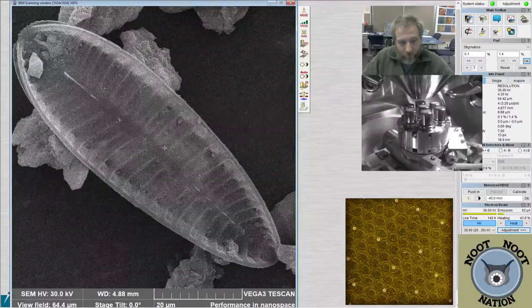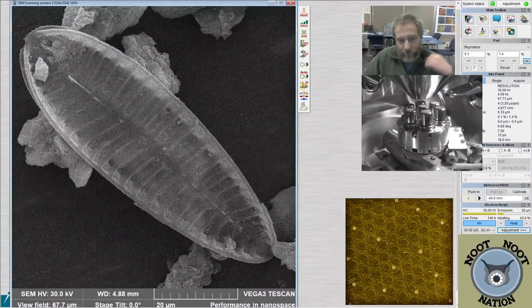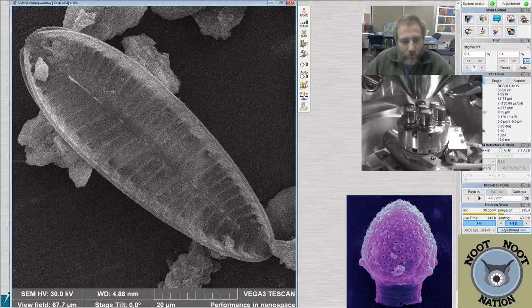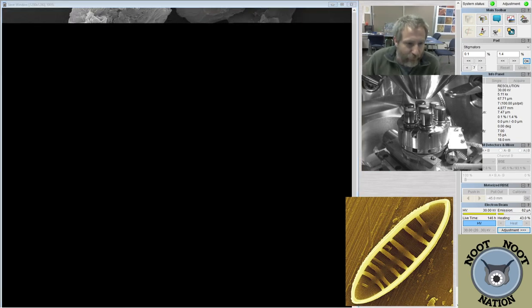And then at least some part of the core will have some interesting diatoms in it for Mary to count this summer when she analyzes the diatoms from this record. So it's a good one. Just go ahead and take that picture, and then I can come back and see what's going on in chat. Probably have enough time for maybe one more picture.